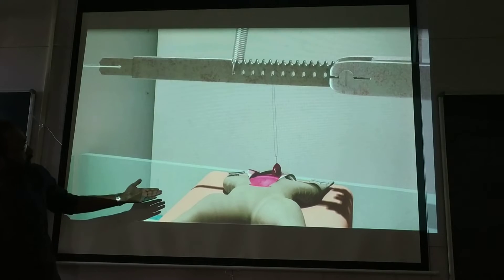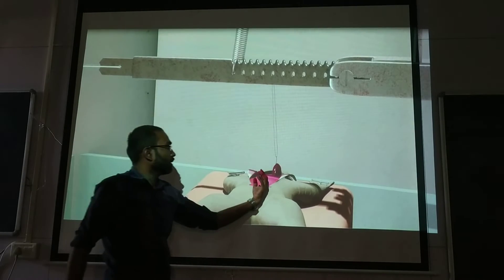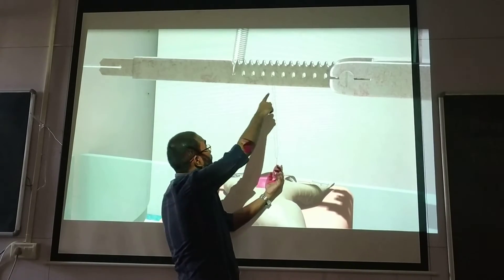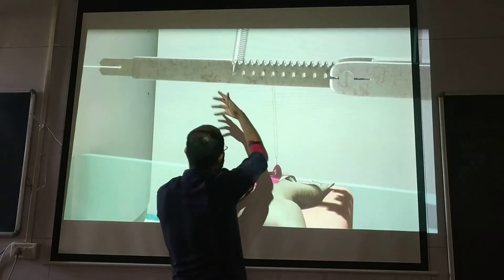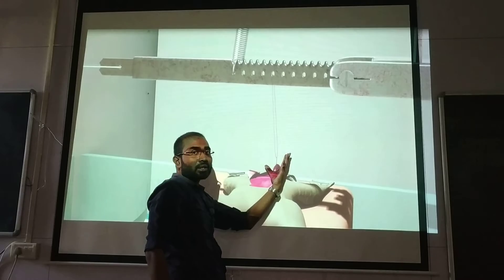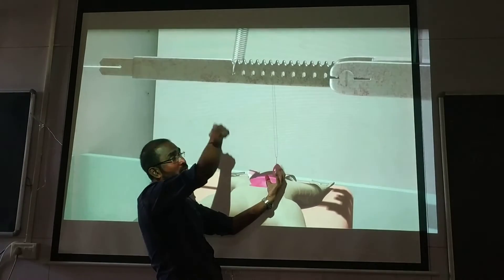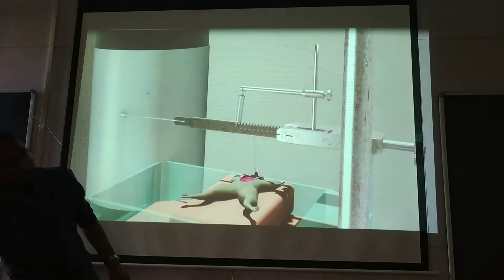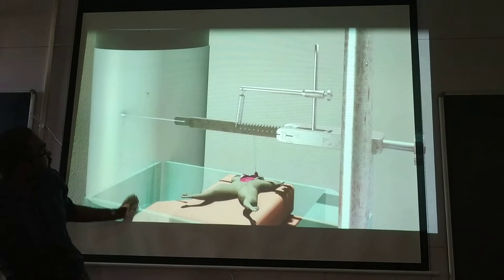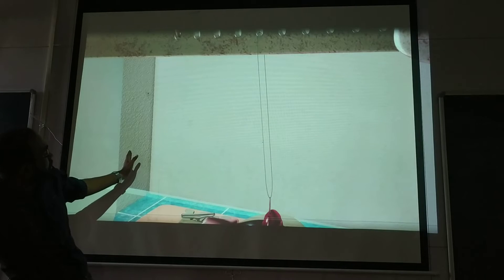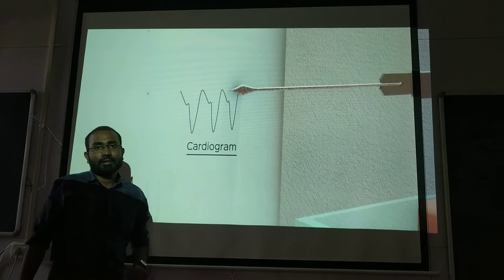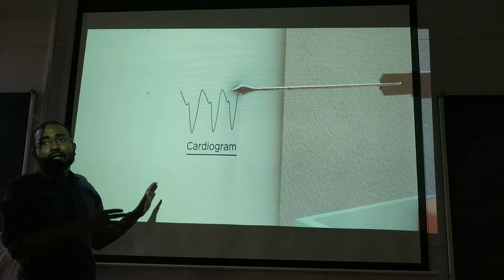This is how it looks. You can see the heart here — it is inverted and the hook is applied, connected to the lever. As systole and diastole occur, the lever moves and records the activity on the kymograph. After recording, you can see this type of cardiogram appearing. This is the normal frog's cardiogram.